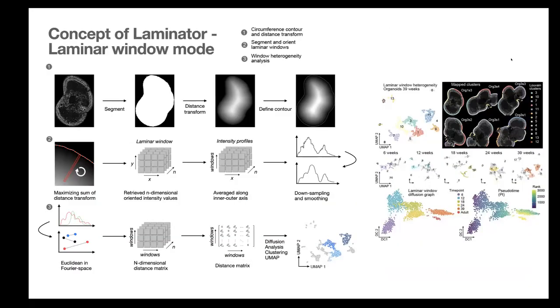So PT on the x-axis is time, or what is it? Yeah, pseudo-time. Just ordering, finding a path through the diffusion space and then ordering the points in there. Here is the embedding for the diffusion maps. And then you see the pseudo-time which you calculate, labeled on top.